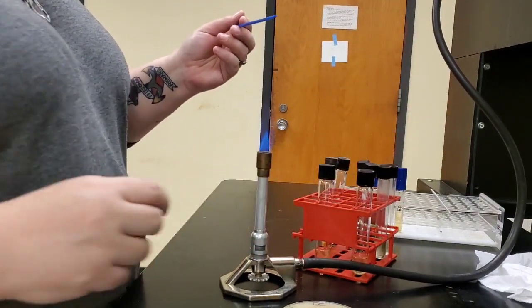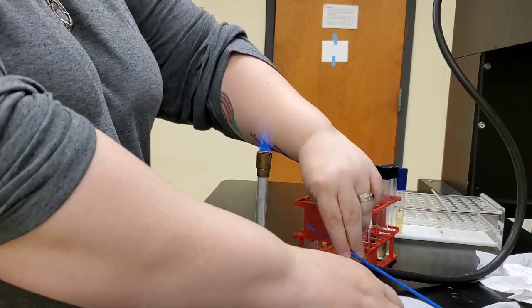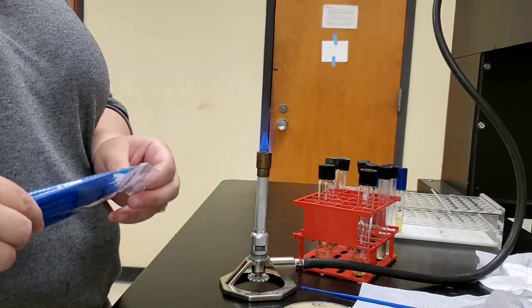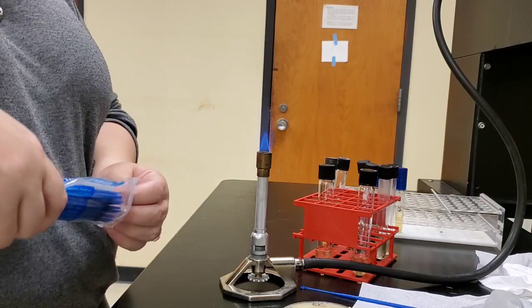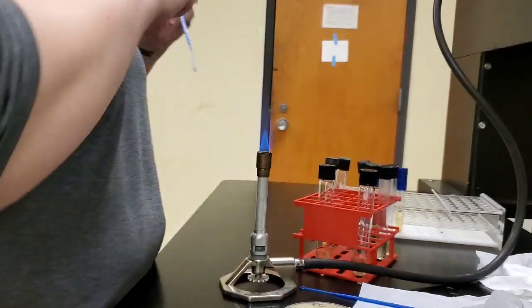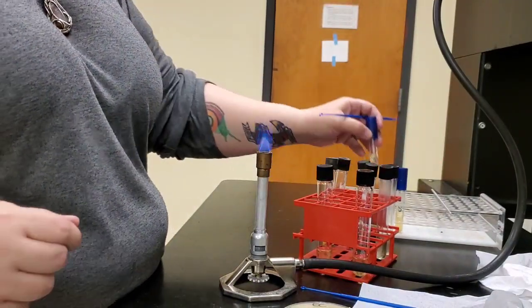Leave the lid lightly capped. Because you can't sterilize these plastic loops or inoculating needles, you just use a different one for a different organism. Organism being E. coli.